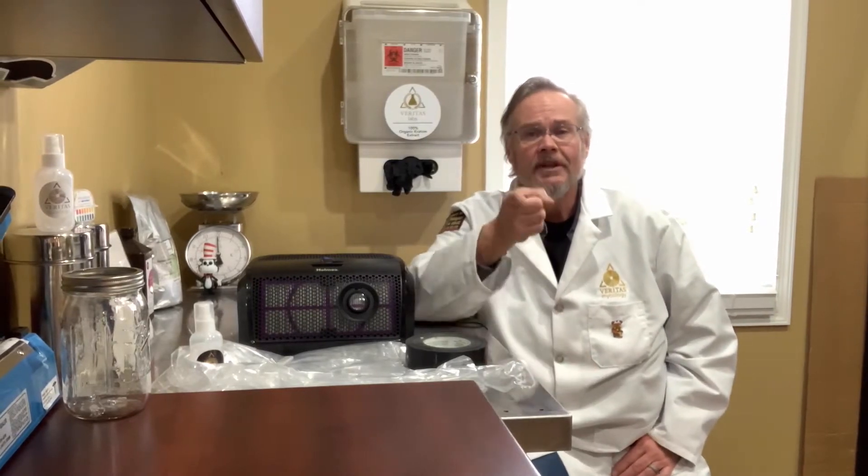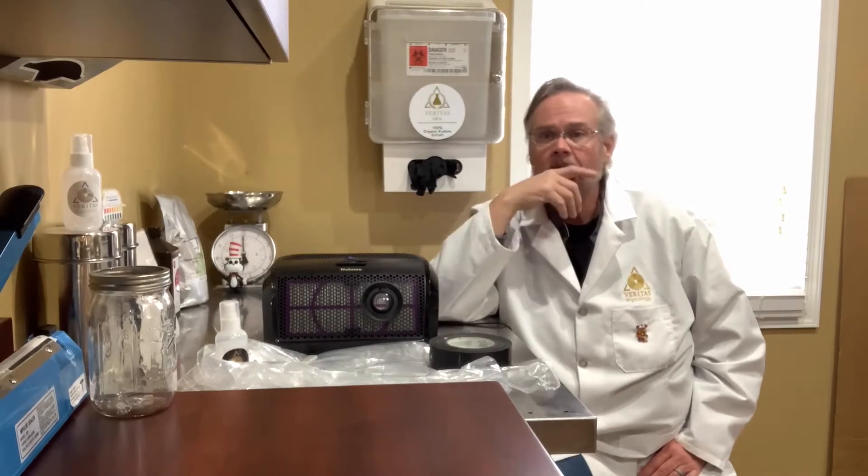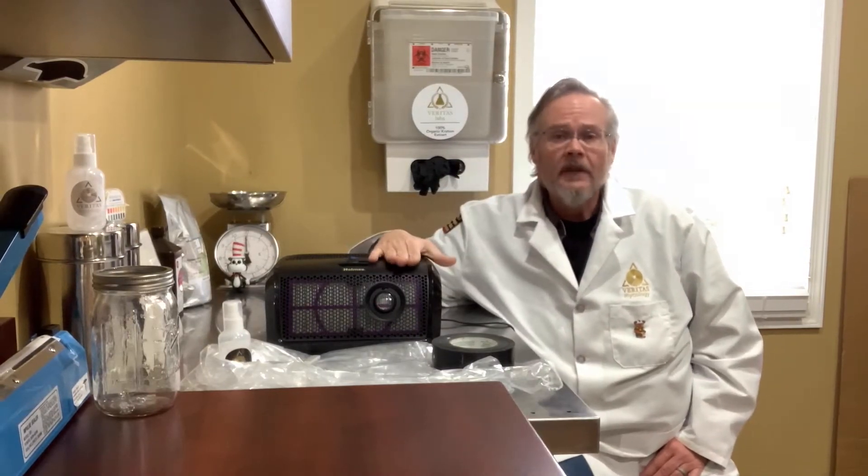Hey guys, it's Dan from Veritas Mycology. It is Thursday afternoon in Virginia and it is about to snow here. I am going to fulfill my promise and finish up this video — create this video for the low-tech flow hood.